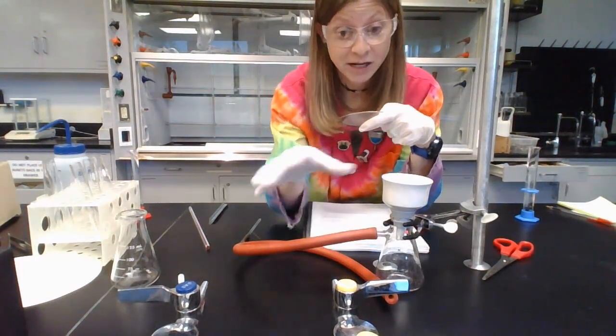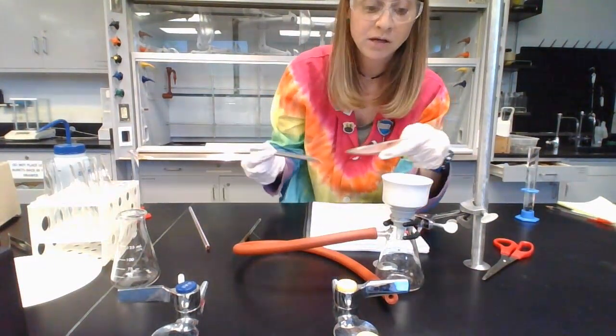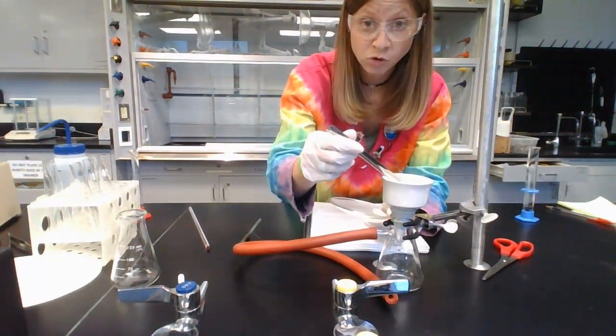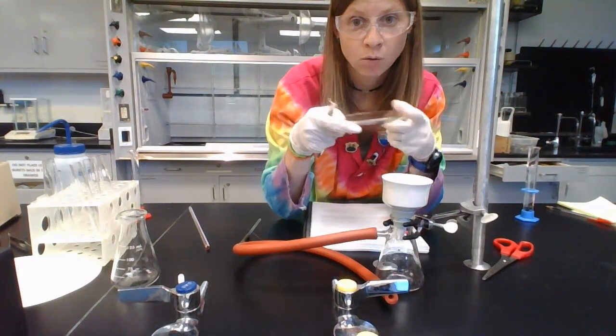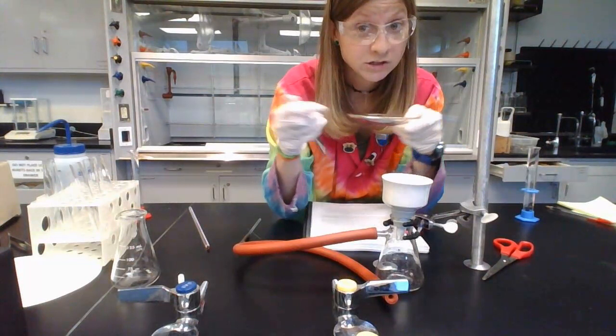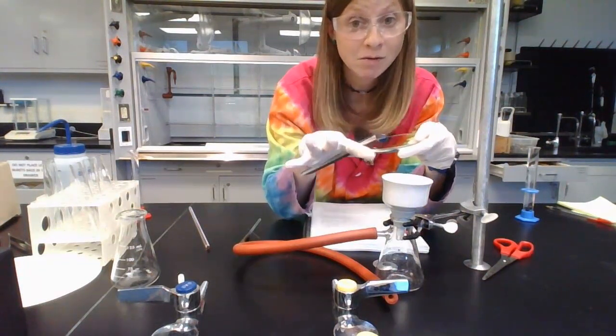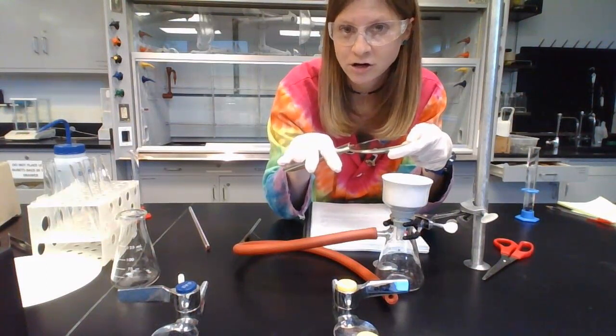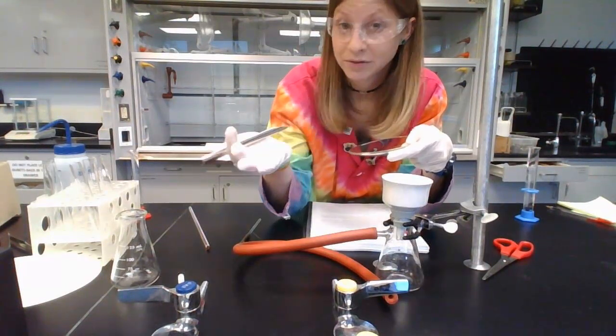When it's been its 5 minutes and you turn off the vacuum, you're going to then be trying to transfer as much as you can of the solid from the Buchner funnel onto the watch glass. What we're going to do is this is going to go in the oven so it can dry even more. Okay, so you're going to scrape as much as you can. Now, you're not going to be able to get all of it. Again, this is where organic chemists and I disagree. It's like, why would you leave it there? But that's what we're going to do.